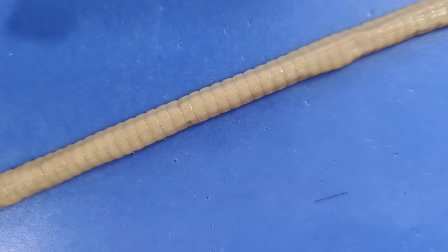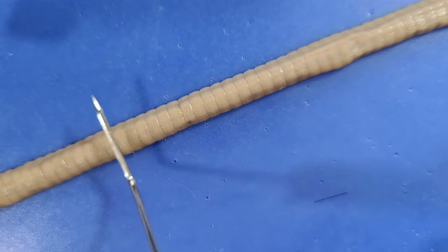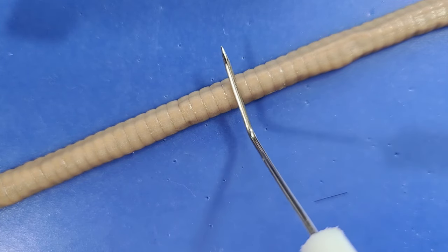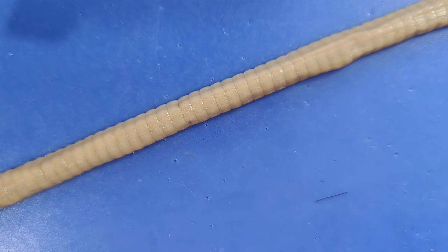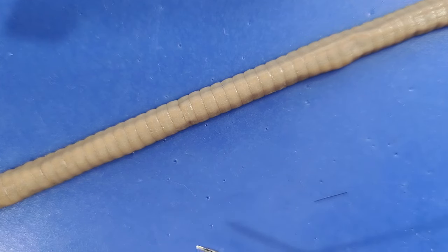You can't really see them, but when I run my probe along the worm, I can feel the setae catch on my probe. So when the muscles along the worm extend, these setae dig into the soil and act as anchors. Then the muscles contract and the anchored setae pulls the rear part of the worm's body forwards.